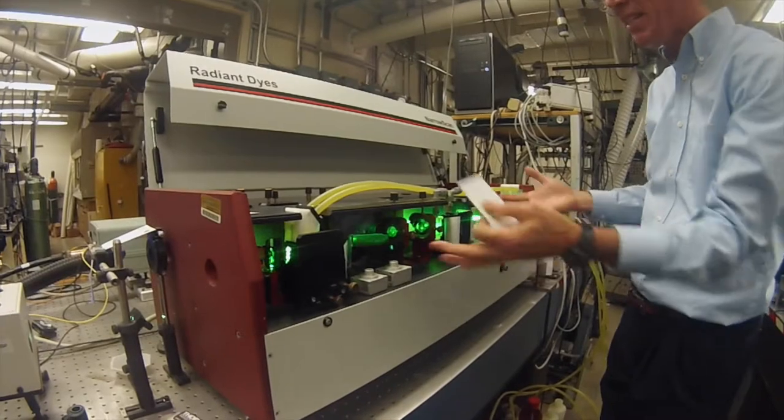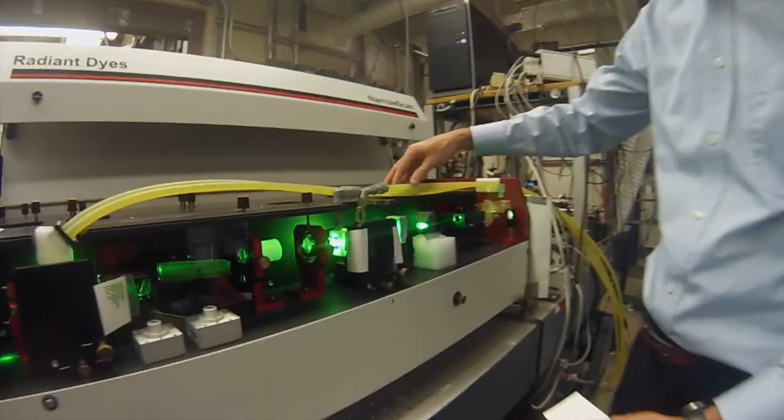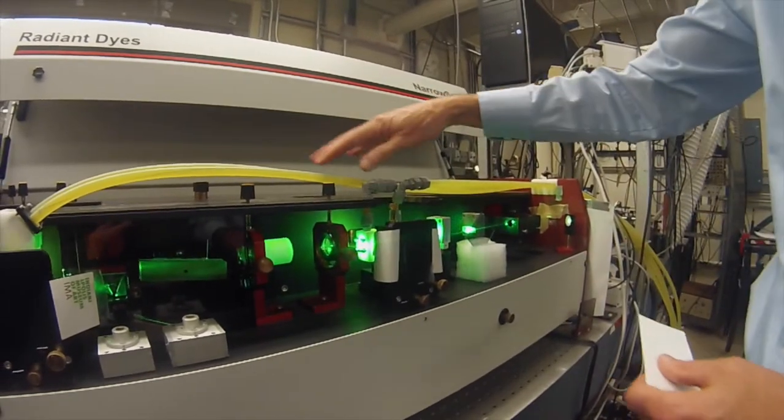And it pumps this dye laser. You can see these are the dye solutions that we use for producing the tunable radiation for doing our experiment.